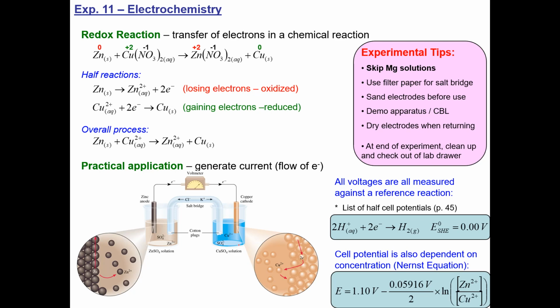Okay, so we have a complete electrical circuit where those 4 steps are all happening. The zinc is releasing electrons, the electrons are traveling through this external circuit, the copper 2+ is accepting the electrons, and then the ions in the salt bridge move to balance things out. Those 4 steps all happen, and I've broken them apart so we can appreciate what's going on, but in real life, these are all happening simultaneously. So we're going to be building these different batteries here in lab, and that's really what a battery is.